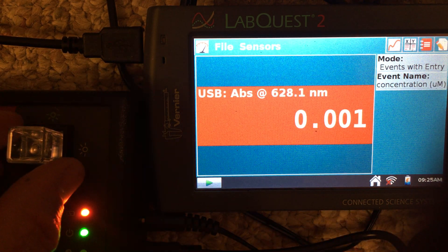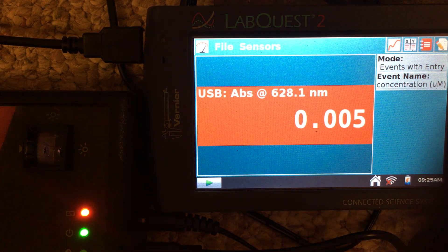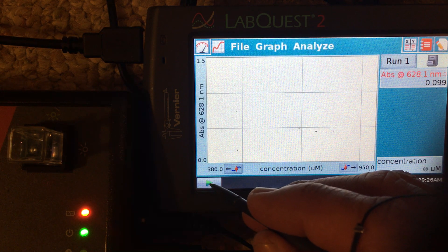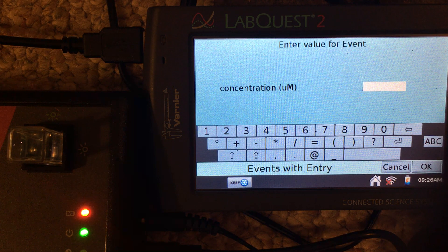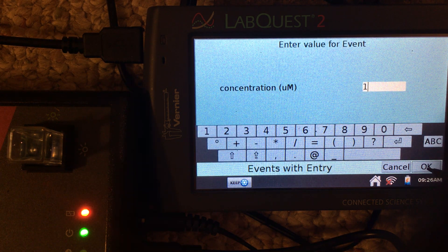Now we can place the first standard solution into the spectrometer — we already have that standard prepared, so we slide it in. We switch to the graph screen and tap the green triangle to begin data collection. We can see there is a measurable absorbance at that particular wavelength. We tap keep and enter the concentration, which in this case is 1 micromolar.